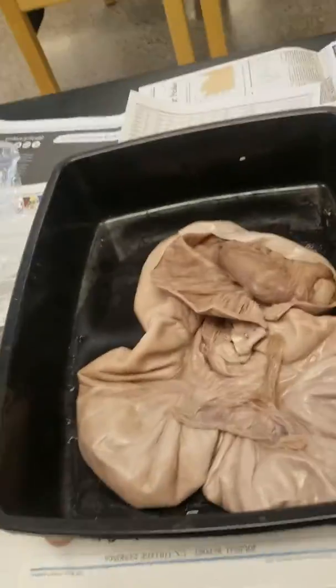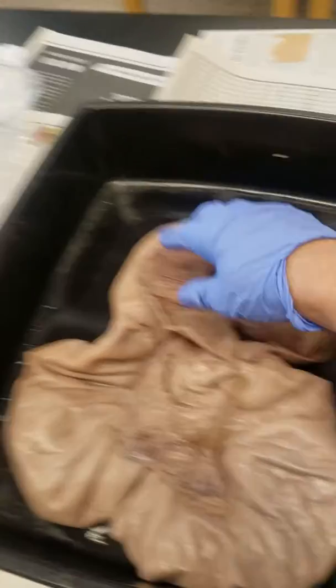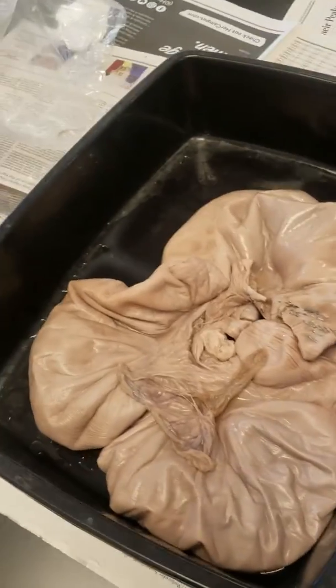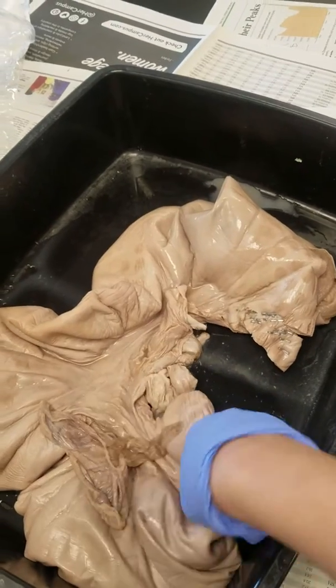Hi, it's your teacher, Ms. Monroe. And so today, because of time constraints with the teacher walkout, I'm going to be dissecting this pig uterus that I ordered for us. So unlike a human uterus, the pig uterus is divided into two horns.